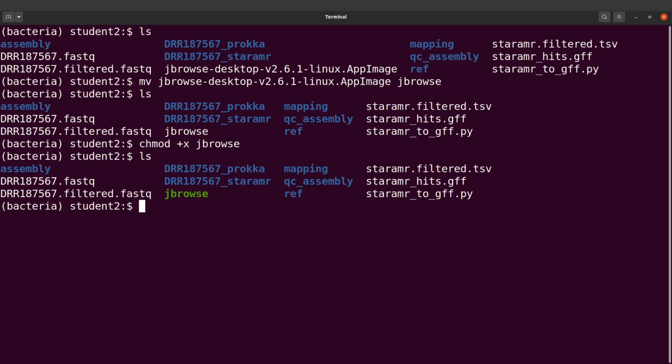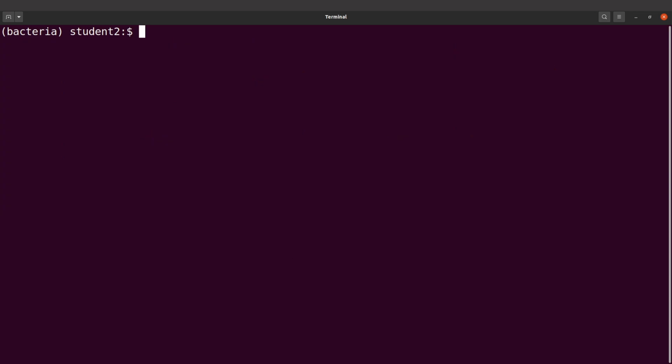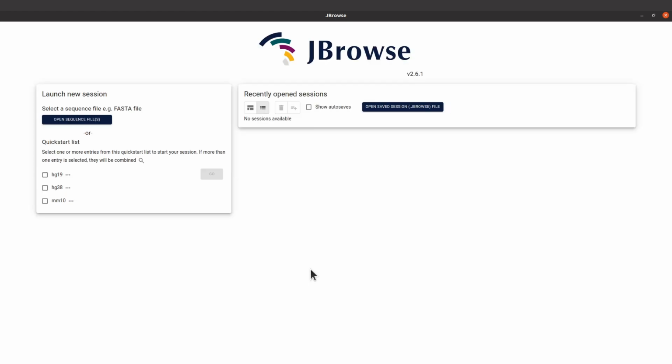All right, so we are now going to call JBrowse. We are going to open it. All right, I'll do it here. So to open JBrowse, I'll say ./ and I'll say JBrowse. So I'll execute this command. So once I do that, JBrowse is going to be opened for me. All right, so now we can start.